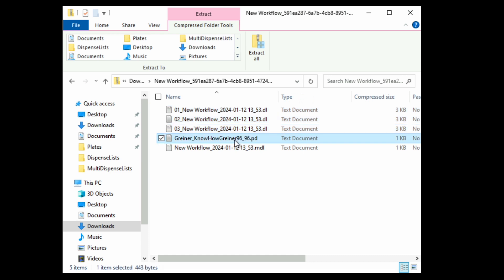The plate layout file, ending in .pd, provides the geometry of all the plates you'll use, so you don't have to define them in the Mantis software. The multi-dispense list, ending in .mdl, will be present if you're dispensing onto multiple plates. This is used to control the order of each dispense.